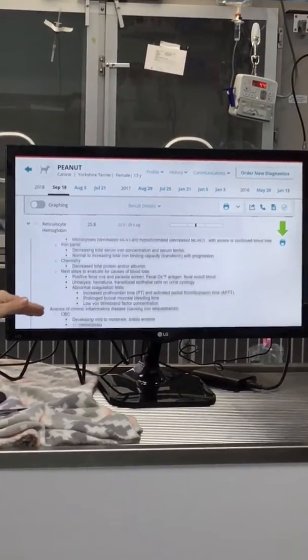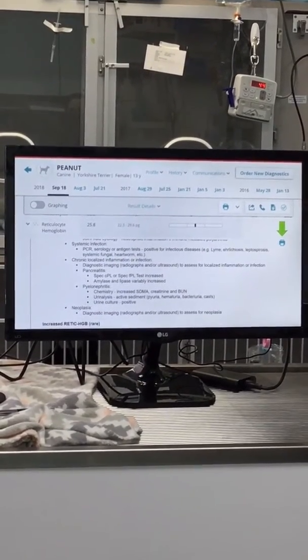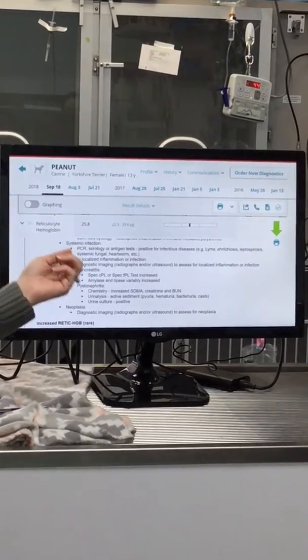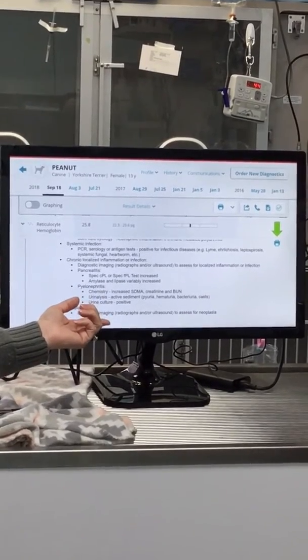What is interesting is on the bottom, it gives you the references. So you're going to see books, you know. But again, instead of having to go in and research it, you don't have to. This is a new test. This is not going to be in any of, well, it's a new parameter. It's not a new test. It was always there. We just didn't have it turned on.